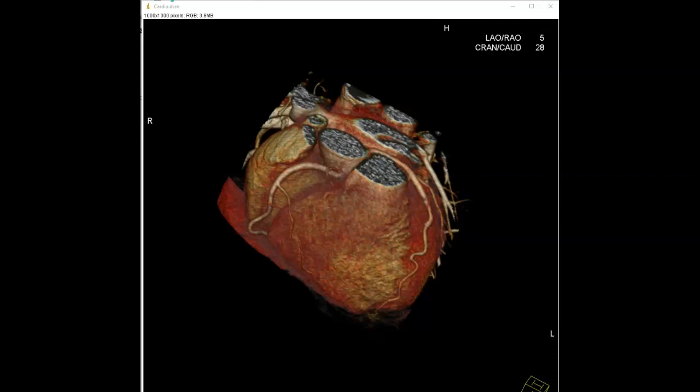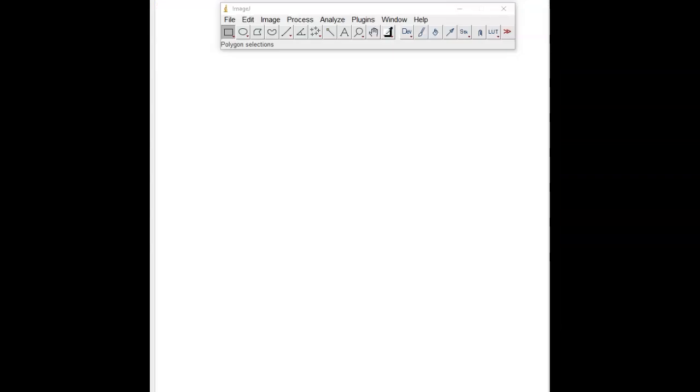The motivation for me to do this video is because I find it fascinating to learn about ImageJ. I can see how the medical profession would be interested in utilizing ImageJ with their images so that they would be able to sharpen the image, create contrast, bring out different objects within an image. Now I'd like to show you a couple of the many functions ImageJ is capable of. This is an incredibly powerful tool with much functionality.